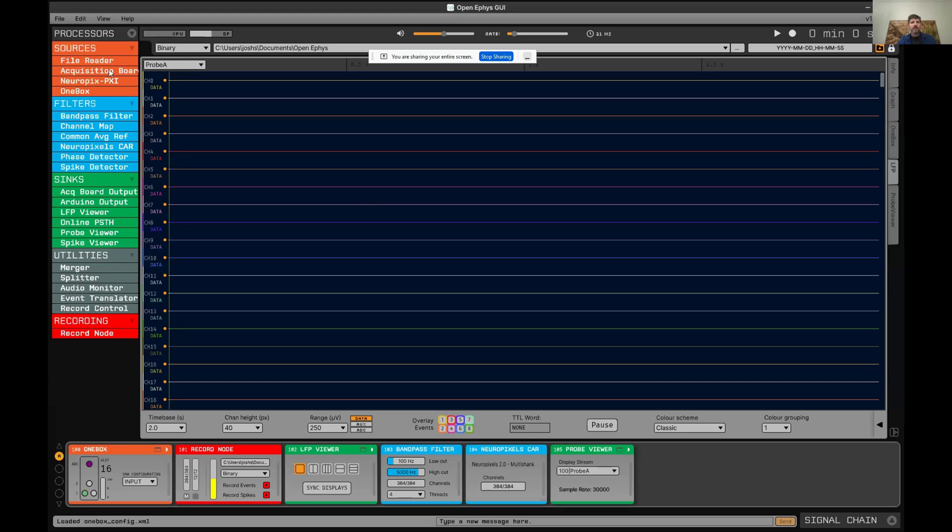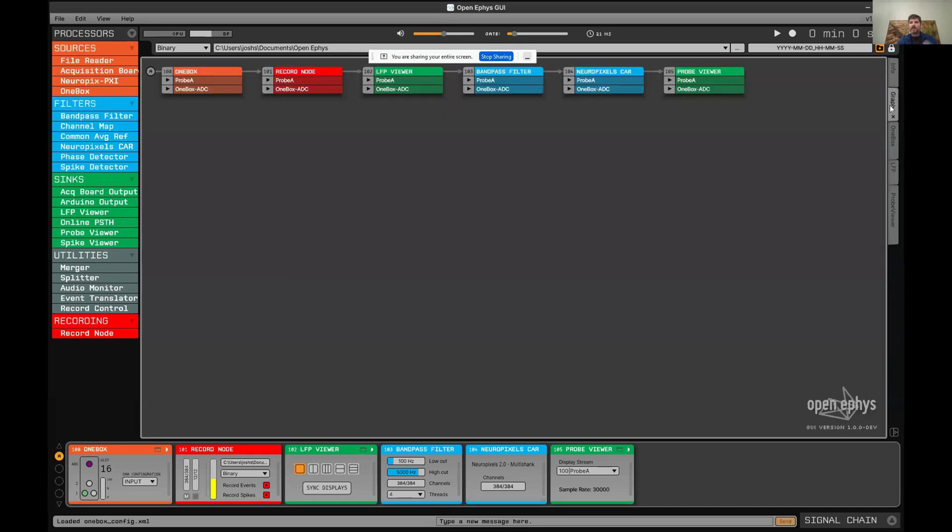On the left, you have all the plugins that are available. You can drag these into the signal chain down here in order to customize your processing pipeline. If you click on this graph tab, it will show you an overview of all the signal chains. It's possible to have multiple signal chains running in parallel if you have different data sources, for example, Neuropixels and National Instruments.